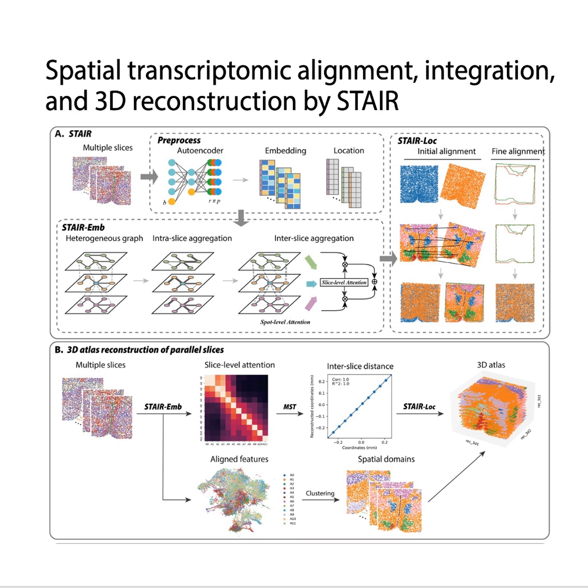That's a massive improvement. Older methods peaked at around 0.46. It just means STAIR was far, far more successful at grouping molecular spots into the anatomically correct layers, even with all the batch differences. But here's the part that really got me. It wasn't just confirming the known biology. It was accurate enough to actively refine the existing annotations. That was the real aha moment.